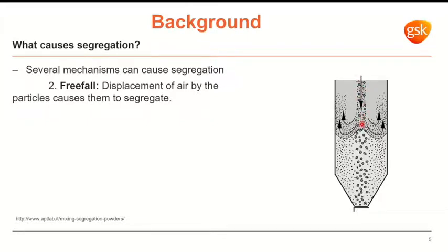As soon as this air is displaced and its place is taken by the particles, that displaced air is going to go towards the side, and that is going to result in the particles, based on their characteristics, especially their mass, being pushed to the side, and depending upon how much push is exerted on the particles, they're going to segregate.